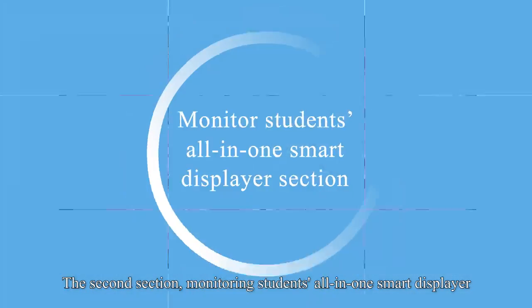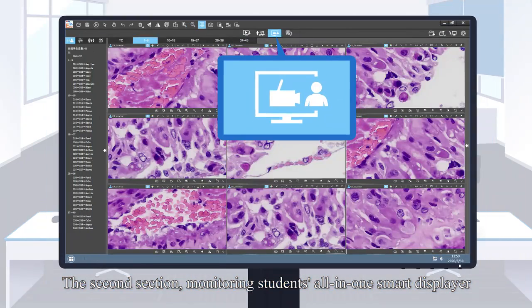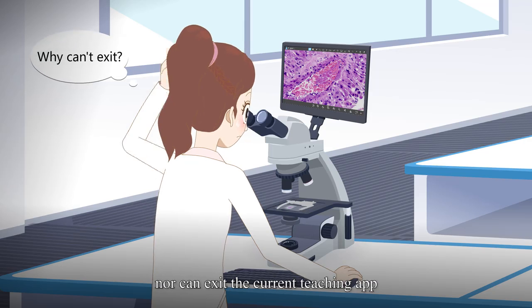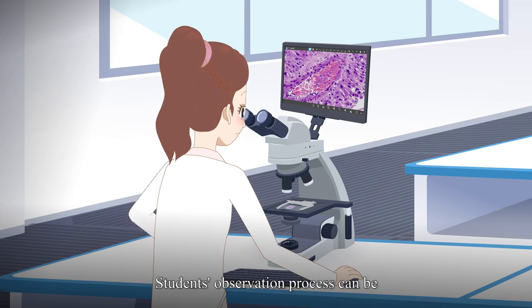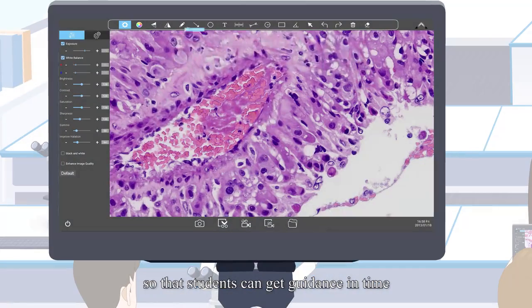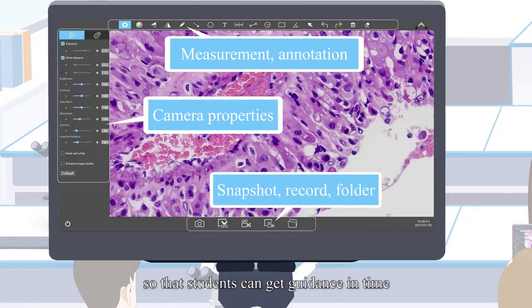The second section, monitoring students' all-in-one smart displayer. Without tutor's permission, students cannot install any APP nor can exit the current teaching APP. Students' observation process can be presented to the tutor simultaneously so that students can get guidance in time.